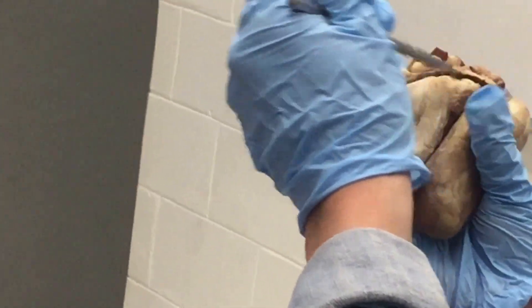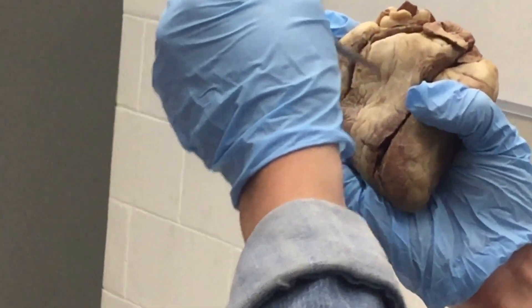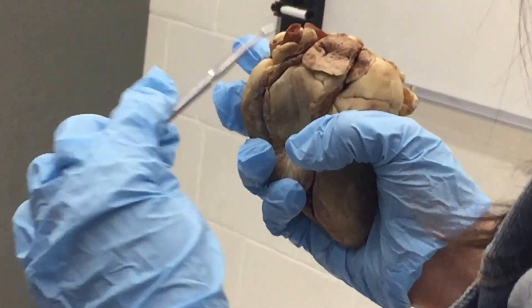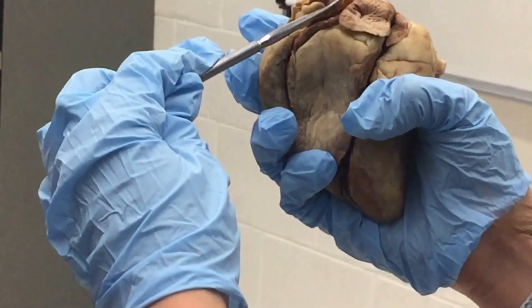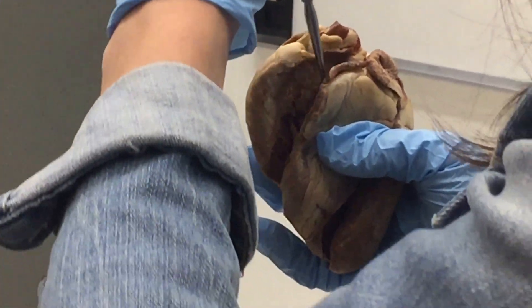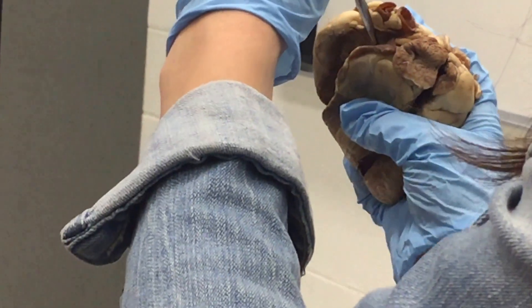So again: left atrium, left ventricle, right atrium, right ventricle. The pulmonary artery is right here. Opening this side of the heart — it's not that clear to see in a lot of these hearts because they're old — but your pulmonary semilunar valve is right here. This is a very thin valve on the right side.